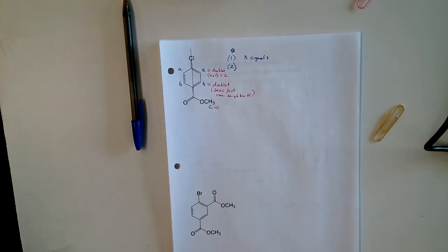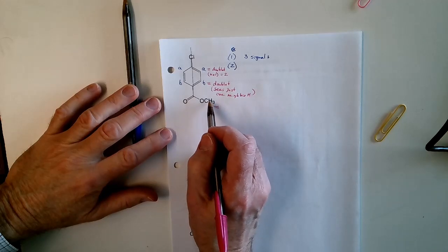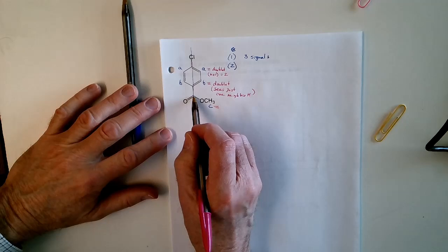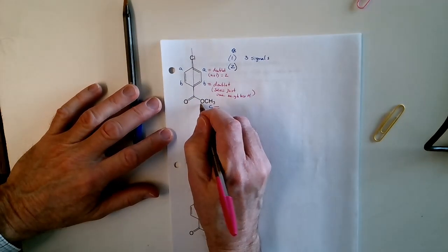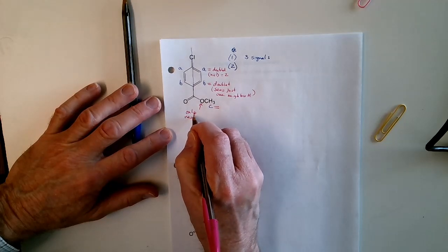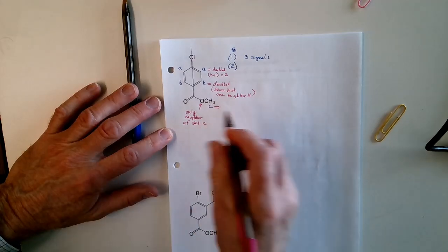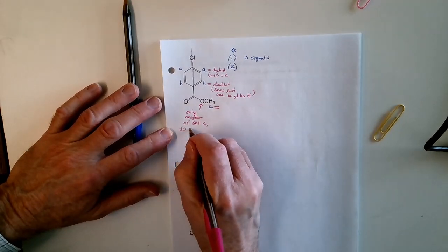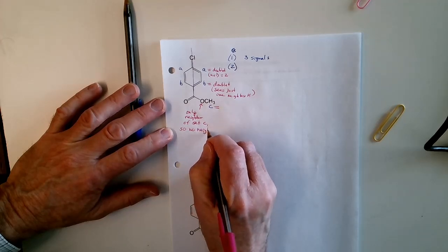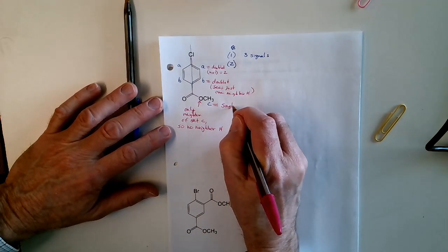And then the last splitting you're looking at is that set down there. And here's maybe an easy mistake to make. You may be going, well, this set right here, it looks at this carbon right here. No, actually it doesn't, because its only neighbor is an oxygen. That's the only neighbor of set C. So that means it's got no neighbor hydrogens. They don't even have any place to sit. It's a singlet. There is no splitting.